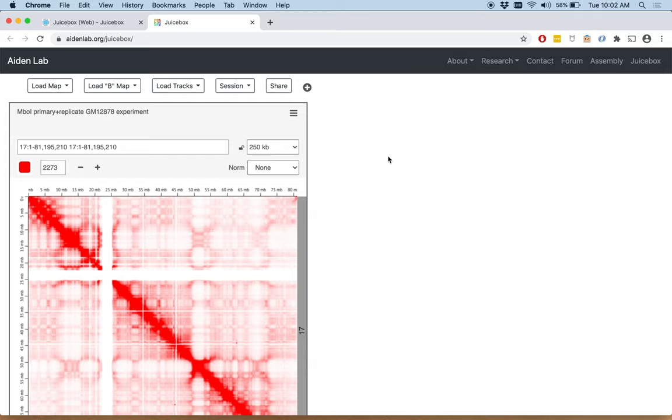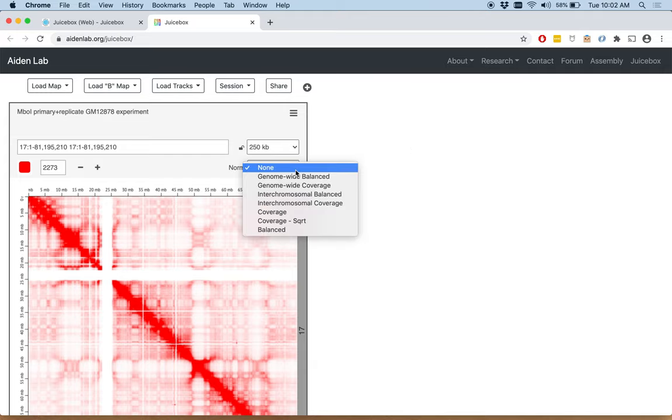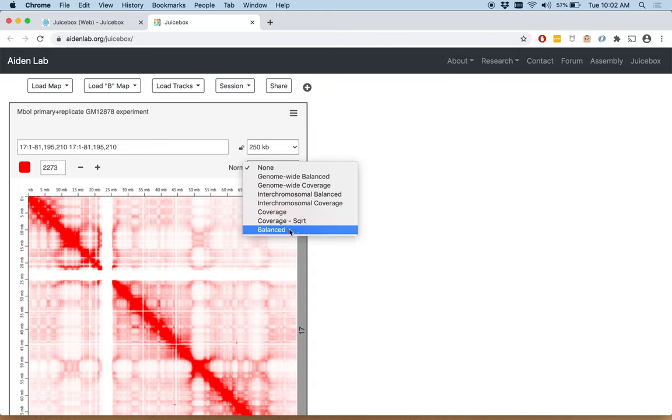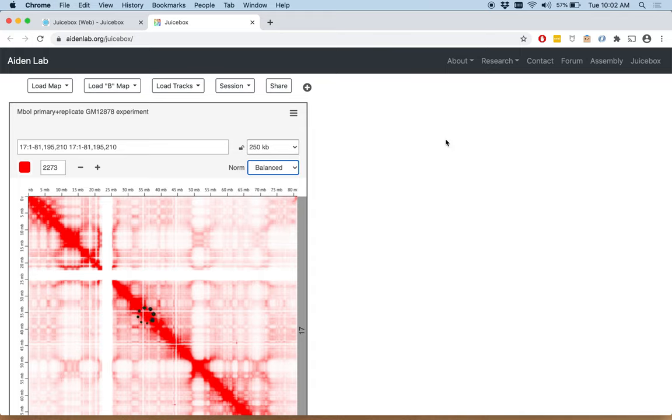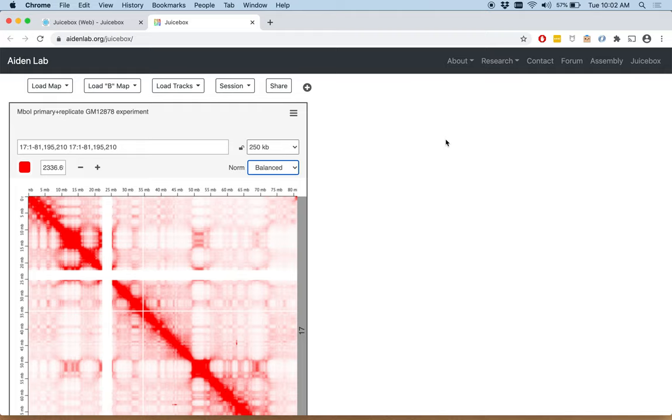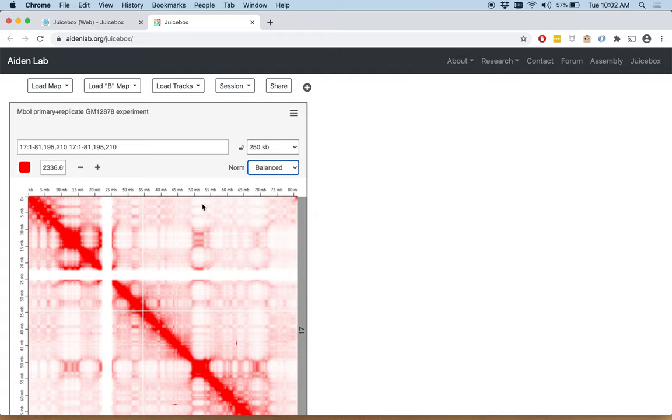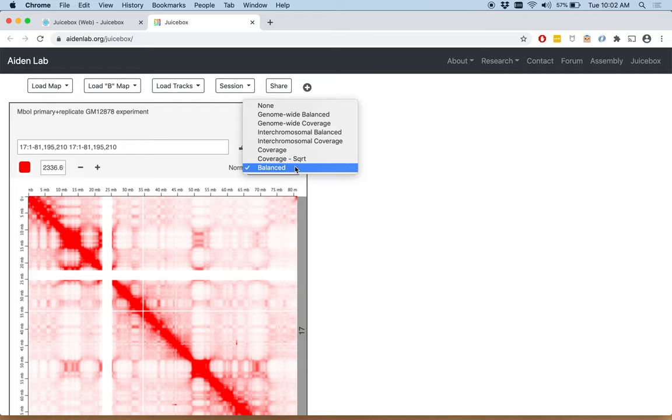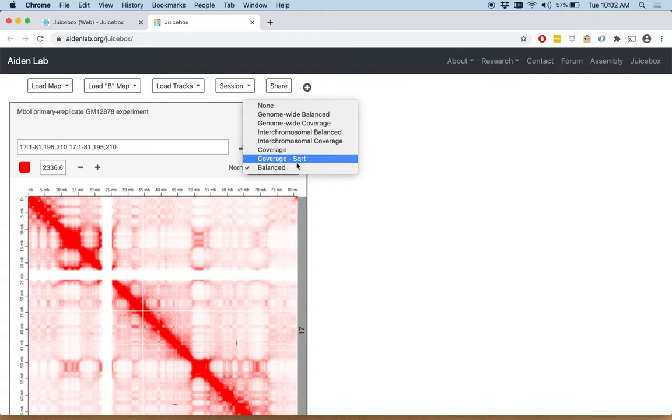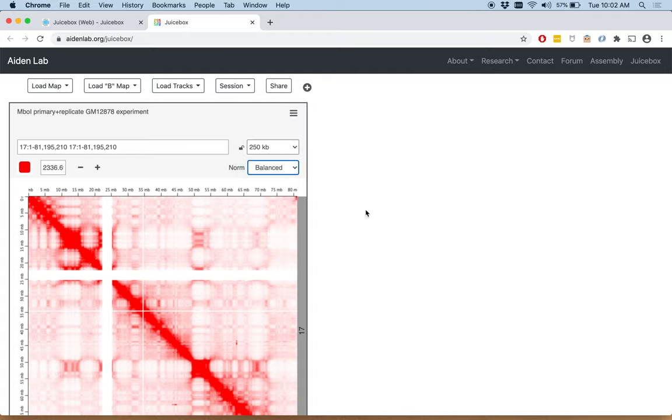Let's change the normalization. We'll change it to balanced. The normalization is merely a way to even out the number of contacts per column or row. In a balanced norm, all of the rows and columns have the same sum of contacts in each row and column. There are other different kinds of normalizations you can apply, as you can see in this menu, but we mostly recommend the balanced normalization.